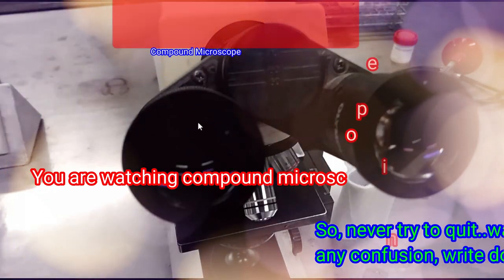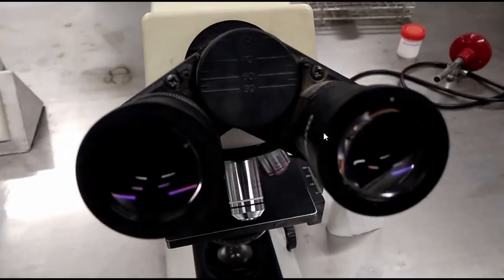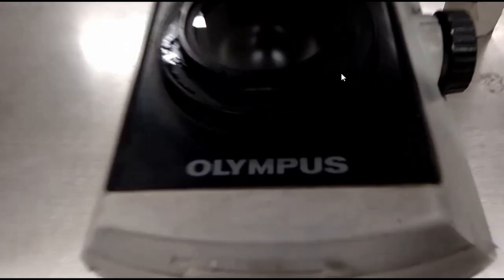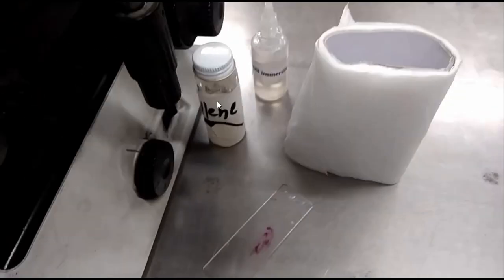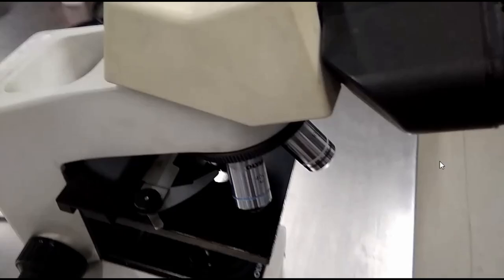Hi, today we are concerned with the use of the compound microscope. Is it a compound microscope? Yes, it is a compound microscope because it has more than one magnifying lens. So here you can see, this is one lens and this is another lens. It is commonly used for laboratory purposes.